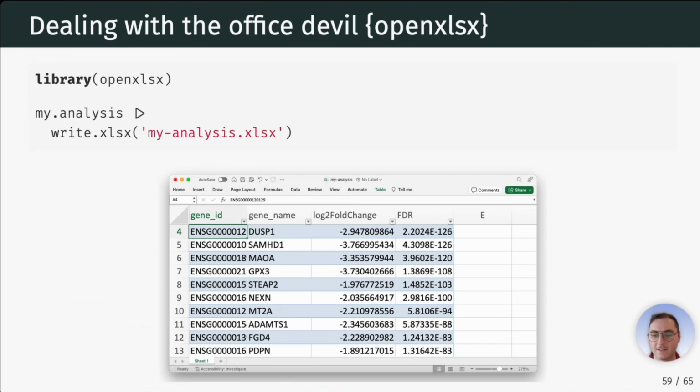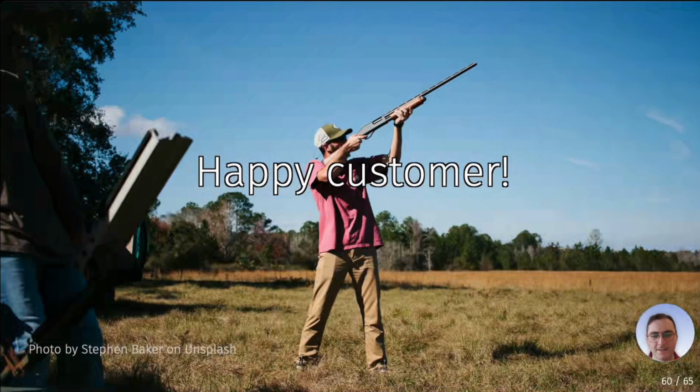I can even add additional parameters that make different highlightings in a way that are of interest, because I, as a bioinformatician, want to have preferably everything as a script, because I know once I've provided the report, automatically the reply will be, oh, what would happen if we use a different cutoff here? And I like to have it automated, so I just say change the parameter as desired, rerun all my scripts, get a report that I then can give to the biologist, who will be very, very happy.